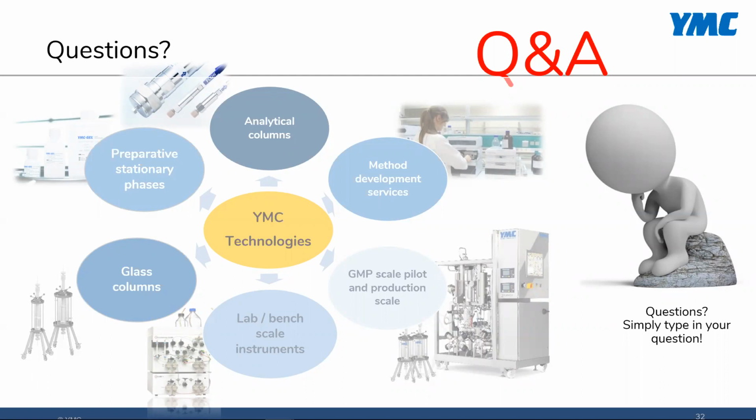So with the DAD model, the piston moves in the downward position, whereas in the DAU it moves in the upward position. So the way you unpack these columns is by moving the piston all the way to the end of the column, and essentially you have a column of used packing material that comes either up and out of the top of it or down out of the bottom of it as the piston moves. So as it goes up, if you're using the DAU, you'll see this column of packing material coming out. You have to sit there with a bucket of some sort or a large beaker and a scraper and scrape it off into the beaker.